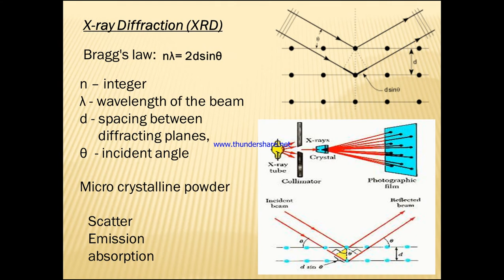The quantum of radiation, that is the X-ray emitted corresponding to this transition, has a time scale of approximately 10 raised to minus 12 to 10 raised to minus 14. So when electrons move from one shell to another, with one electron pushing out a low energy electron and the gap being filled by another, we see the diffraction or reflection of radiation from the material.